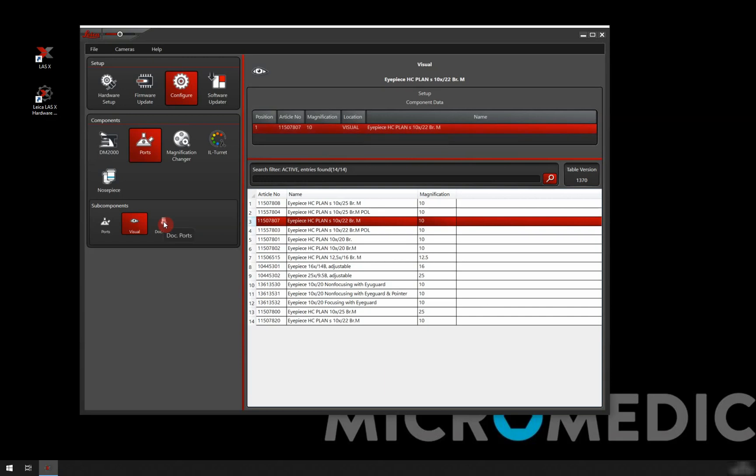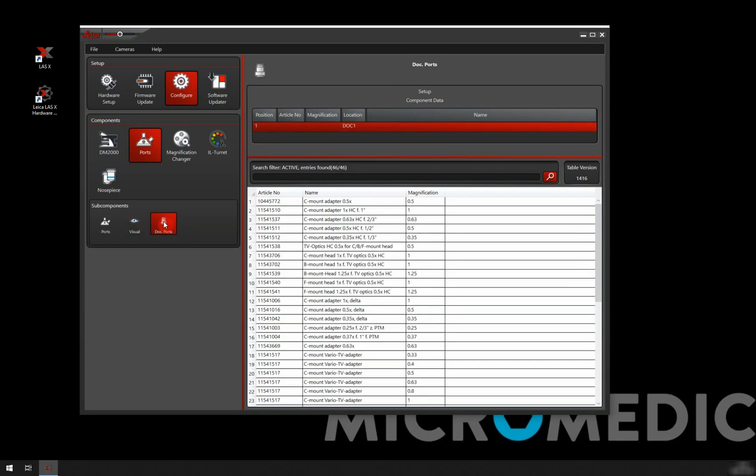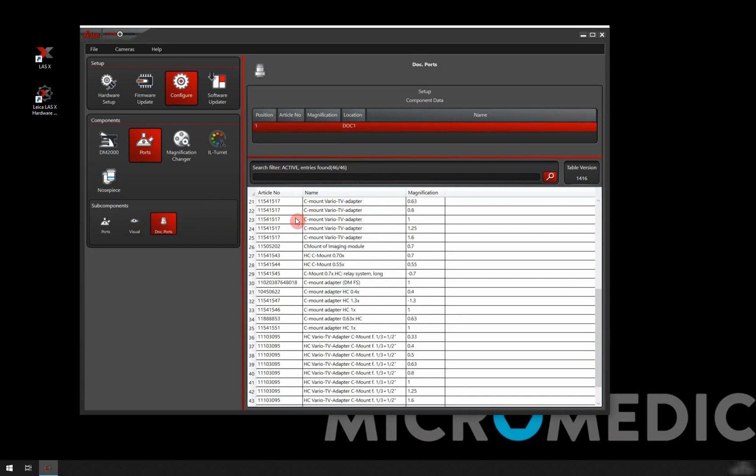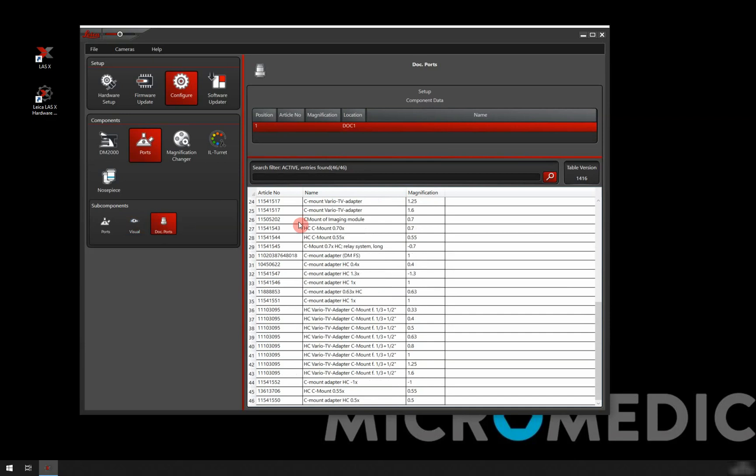We move on to the documentation port. This is where we have our camera. Here we have to choose which C-mount adapter we have. In my case, again, we have a list. It's a bit longer.